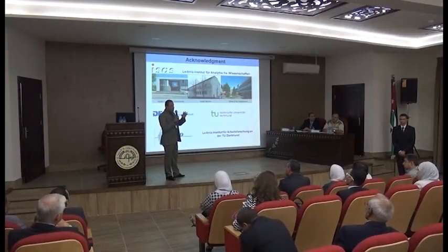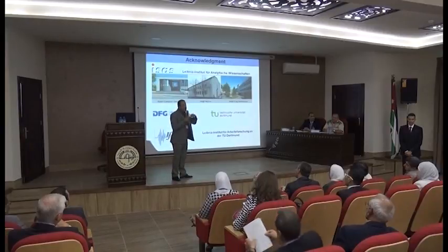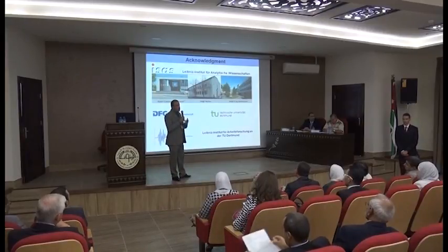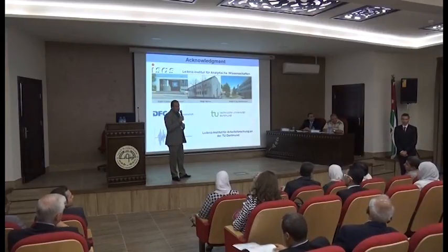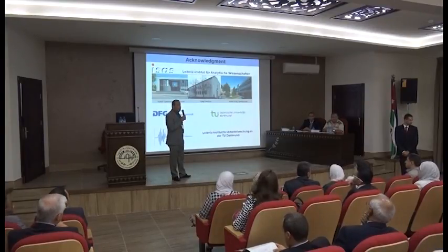The spheroid is almost between 200 to 500, and in spite of this very small 3D volume, there's also a distribution inside. And this is the most interesting information. Most of your measurements are done not on cell extract, but on whole cells? Yes, in living cells, in real-time living cells.